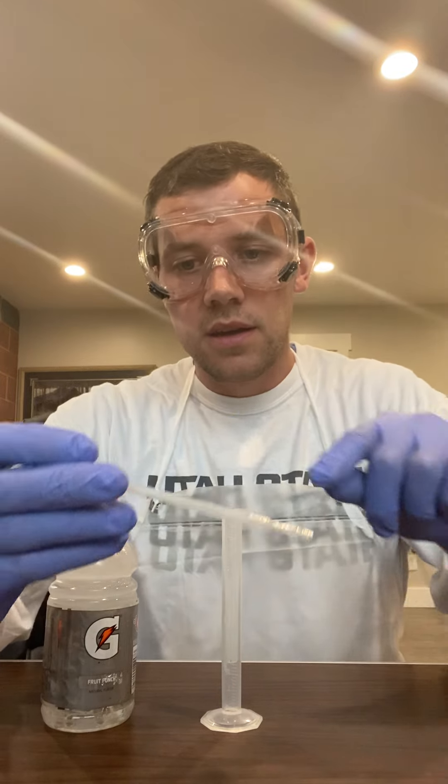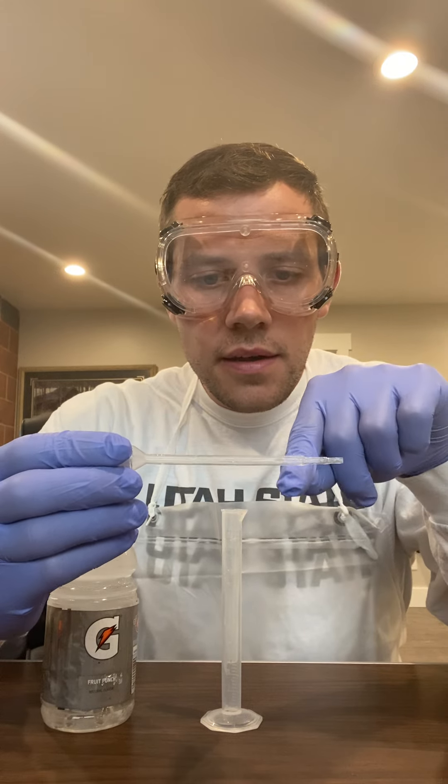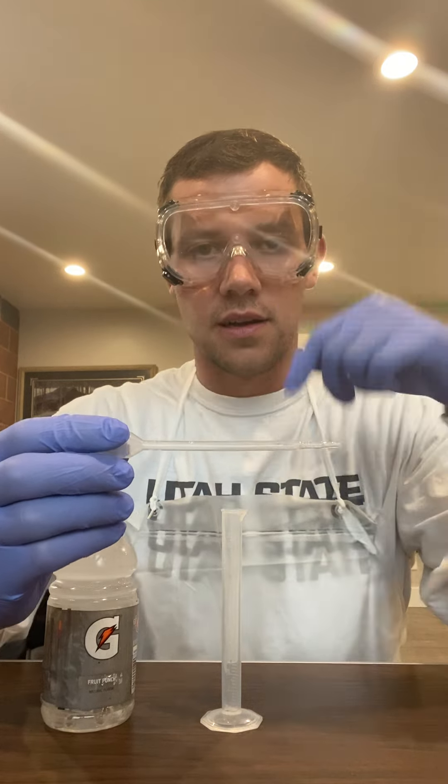Our pipette here — right here is the line measuring one milliliter. We have half a milliliter, and that is all that this one will measure. So I need half a milliliter from this Gatorade bottle into my graduated cylinder, but the problem is all of my trusty followers know that my graduated cylinder measures in increments of 0.2. So we're gonna need a pipette in order to make this happen.